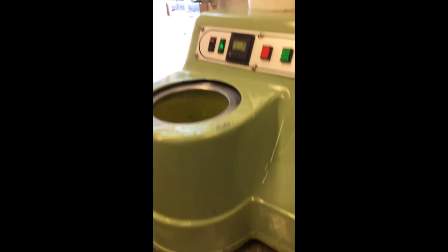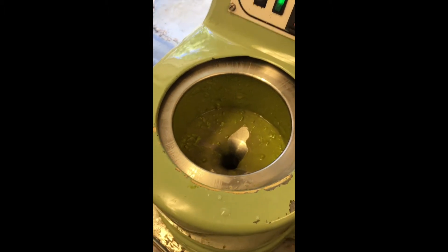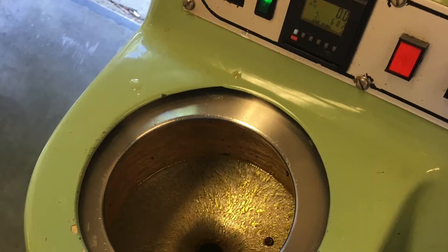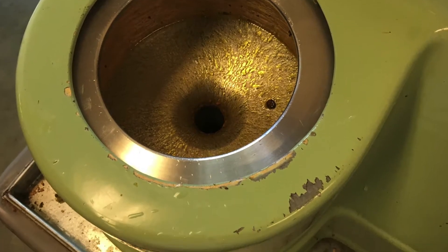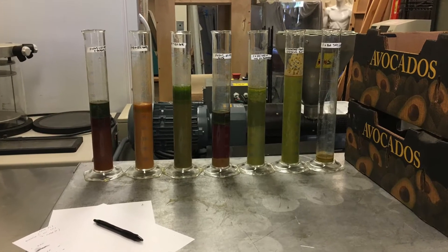Fresh olives or avocados are crushed by the crusher and sent to the malaxer for oil accumulation over 30 to 45 minutes. The mixture is then separated in this bench-top centrifuge before decanting takes place. This is the only way we know for sure our olive oil or avocado oil is pure.